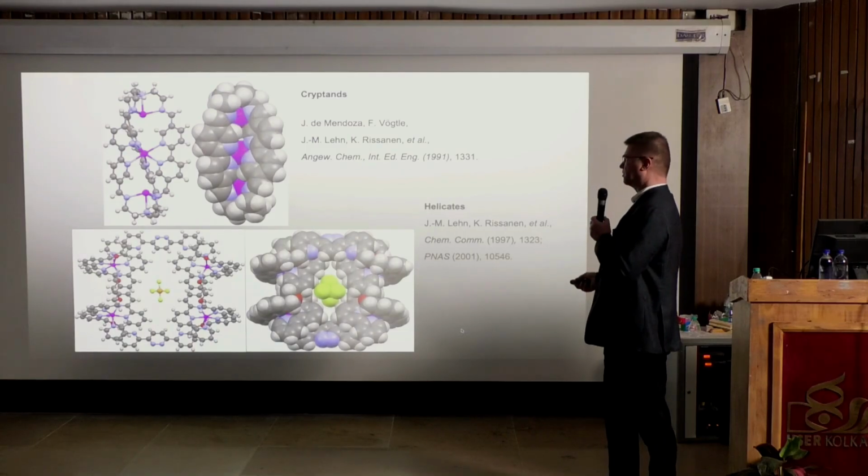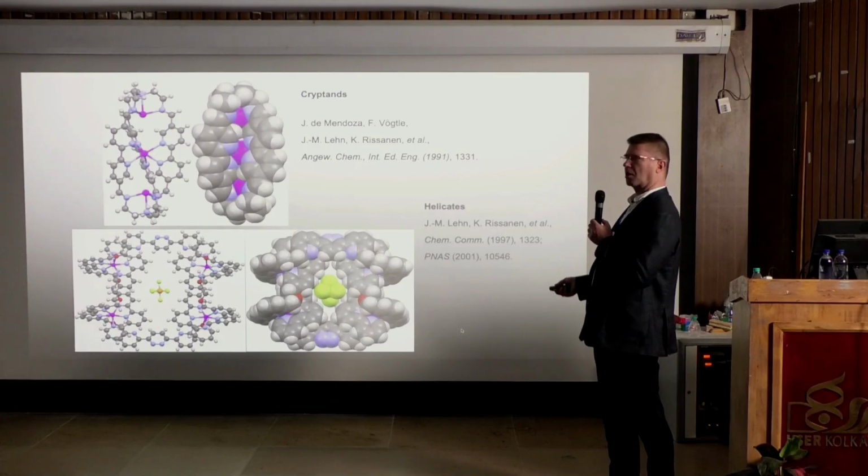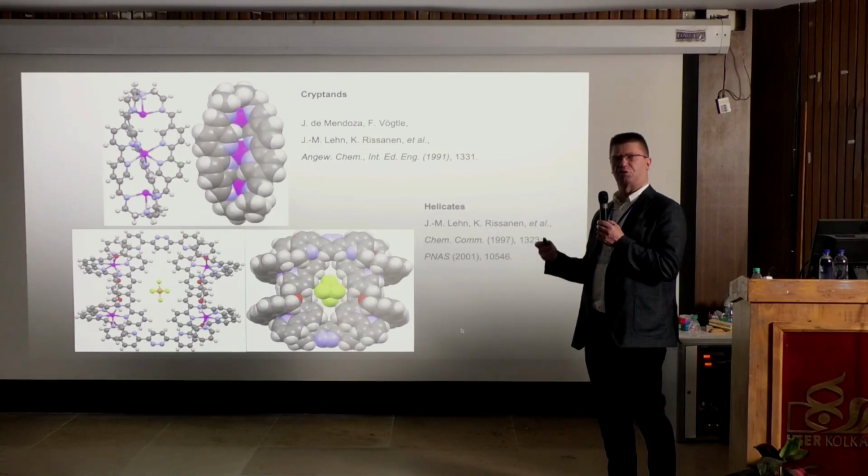And this is a really interesting structure, which is a double helicate, which makes a cycle. So in a certain sense it's 2 times the same thing.